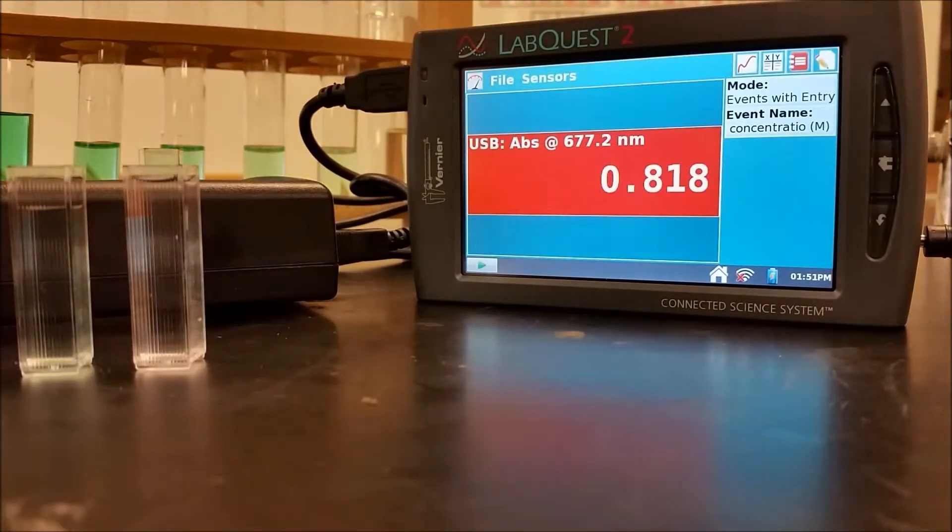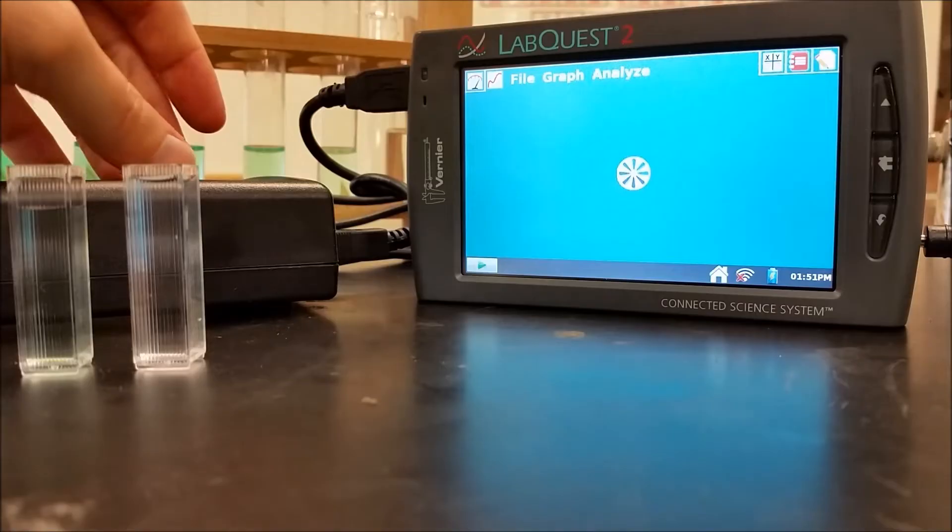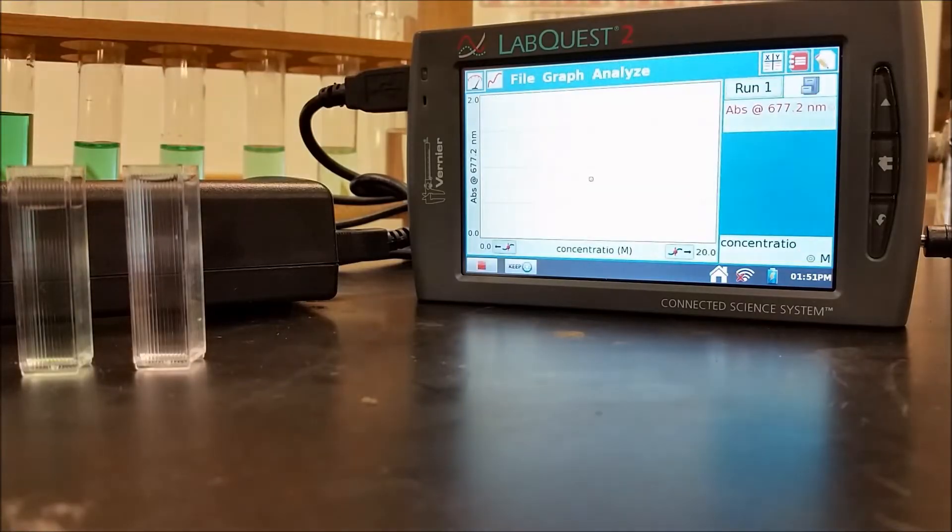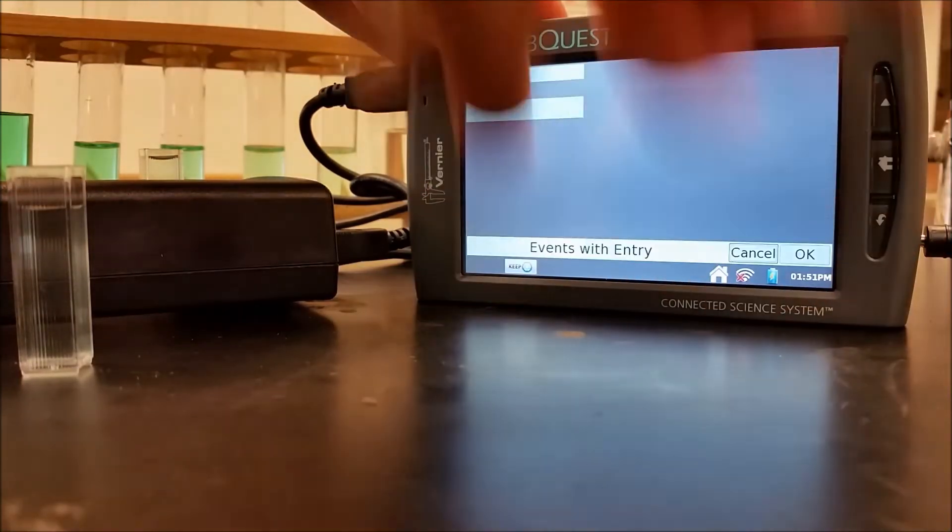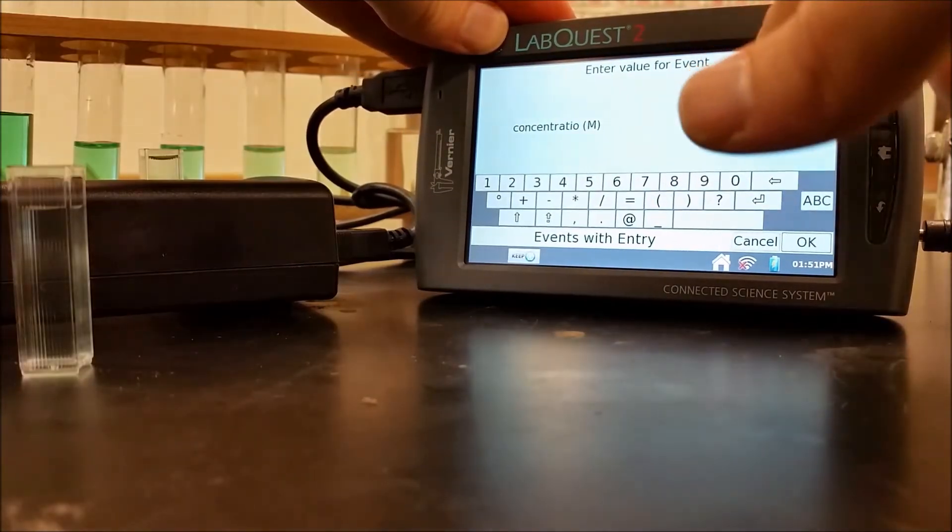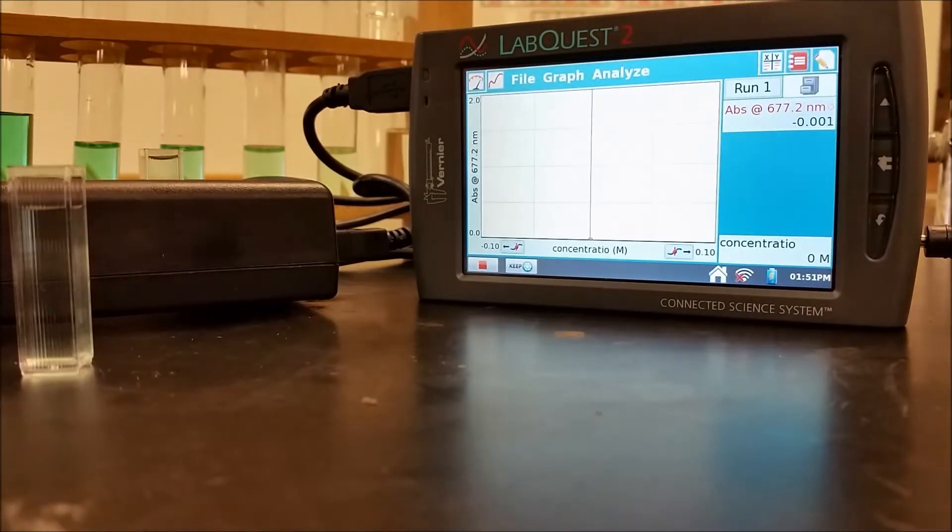So now I have my wavelength set, and this is now telling me what the absorbance is. So I'm going to hit Play and start collecting my data. So now each time I put one of these solutions in, it's going to tell me what the absorbance is. So I'm going to start with my blank. My absorbance should be about zero, which it is. So I'm going to hit Keep down here at the bottom. And then I'm going to type in what the concentration is. In this case, it was zero. And that just kept my point.